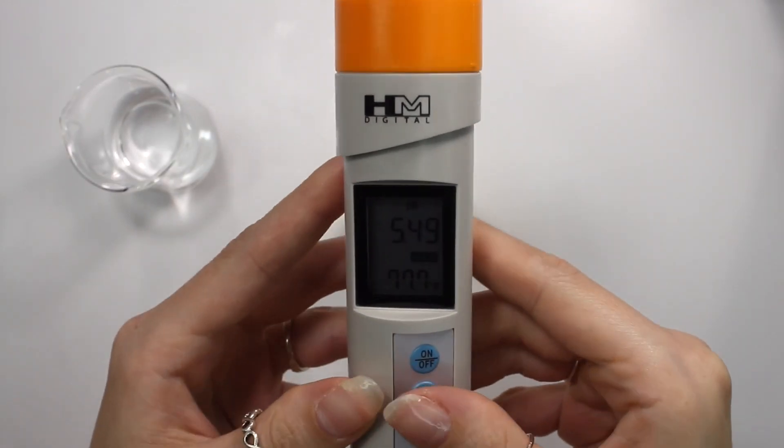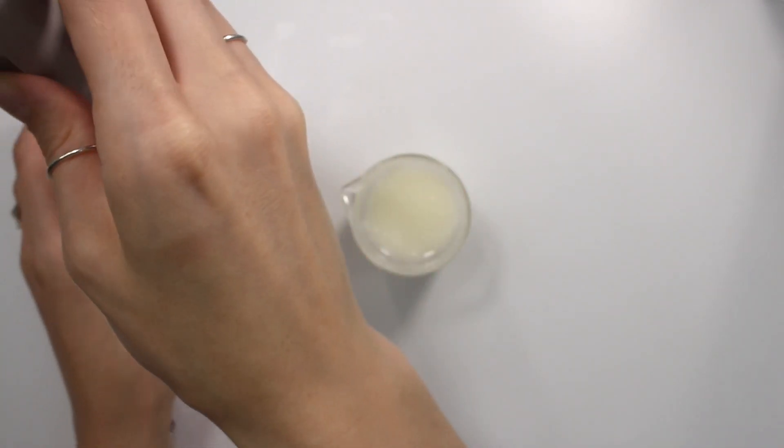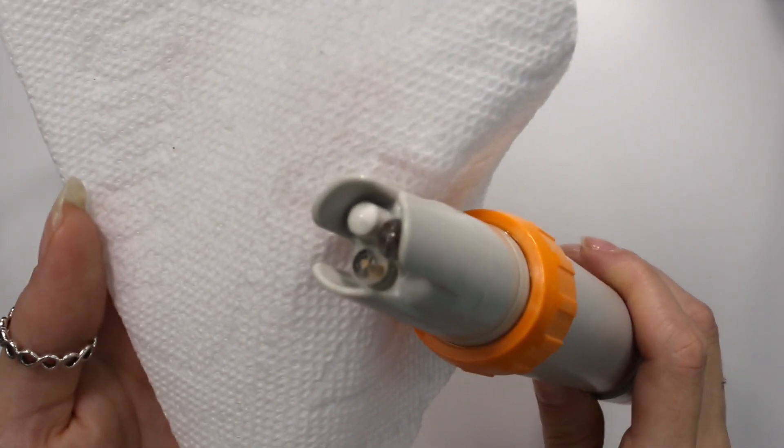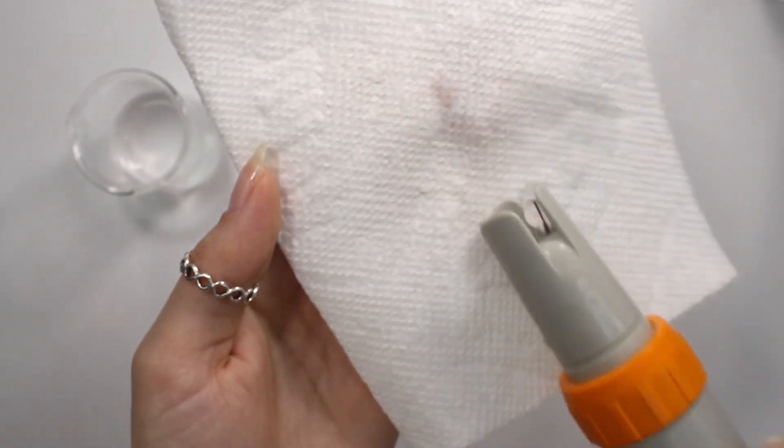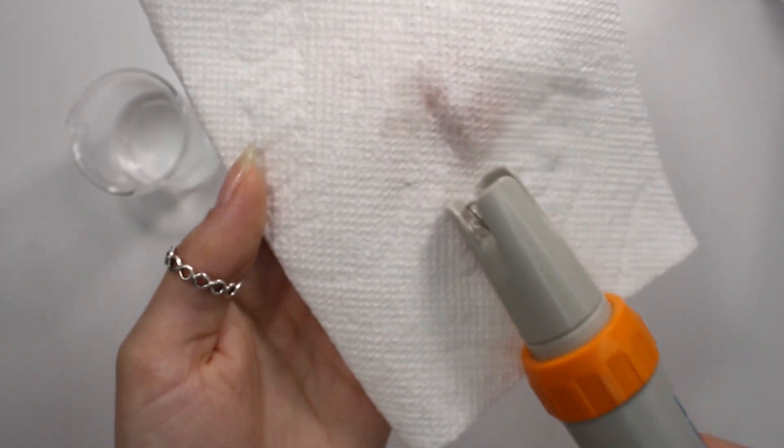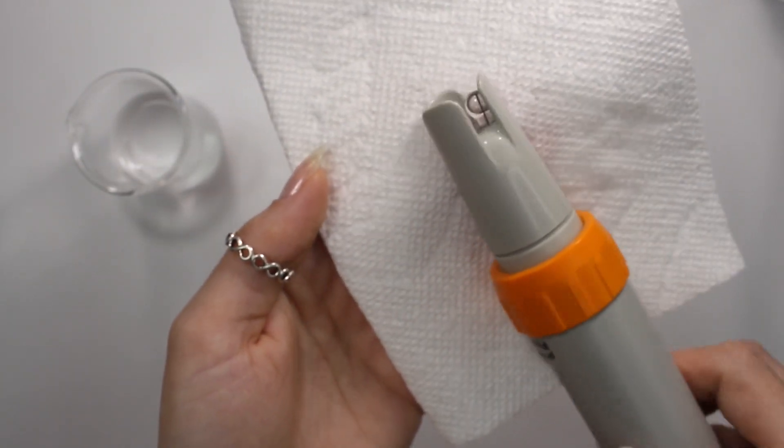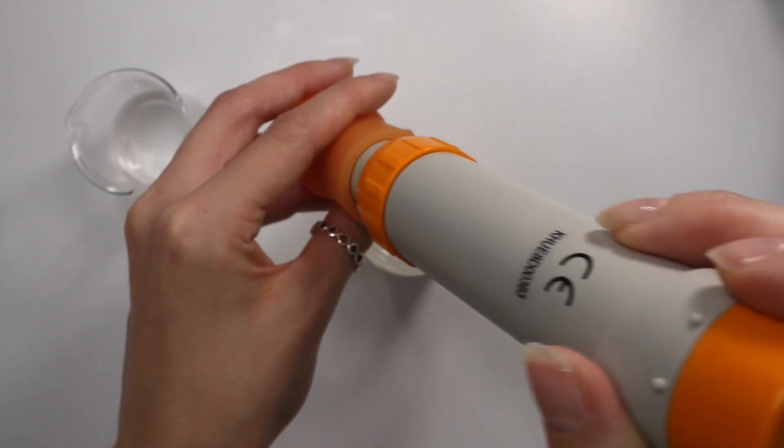And after about a minute, this is reading a pH of 5.49. So then you just want to rinse it off in your distilled water again, and then just gently dry it with a paper towel and be sure not to touch the glass electrode like I mentioned before because you can damage it or scratch it and it can completely mess up the pH meter. So then afterwards you just want to recap it and set it to the side.